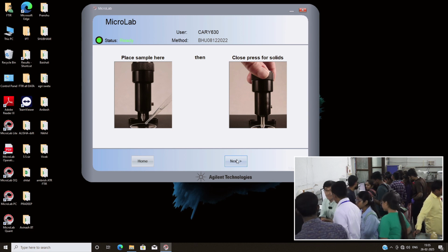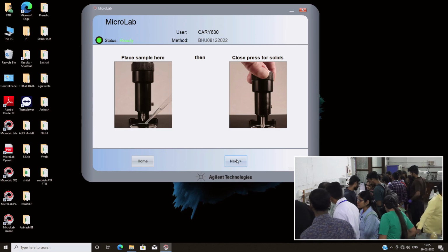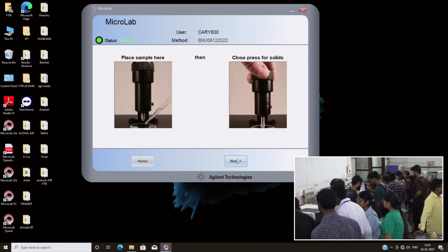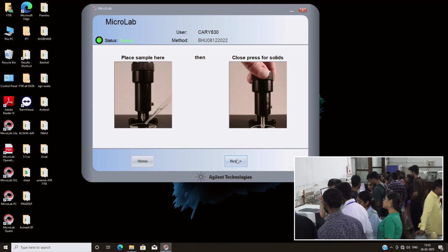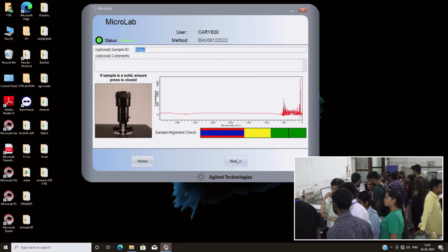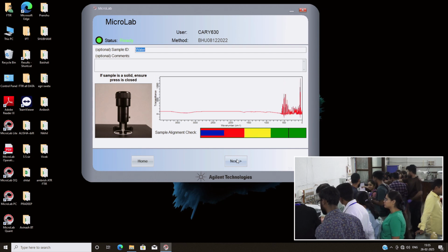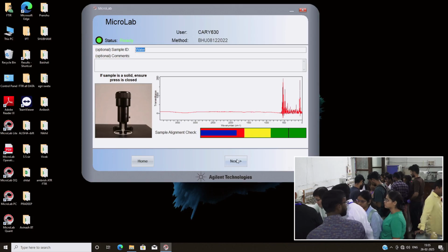When we take solid for analysis, is there any difference in peak intensity or anything else? Actually, the absorbance has physical meaning by itself, so there is no standard necessary. Absorbance 1.0 means I is 10% of I0. Okay. Then shall we go to the next?